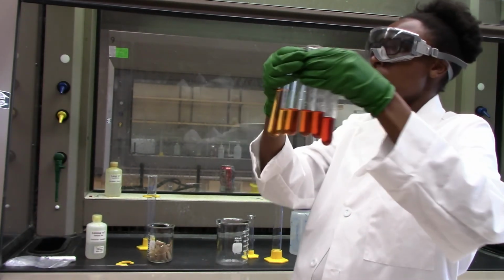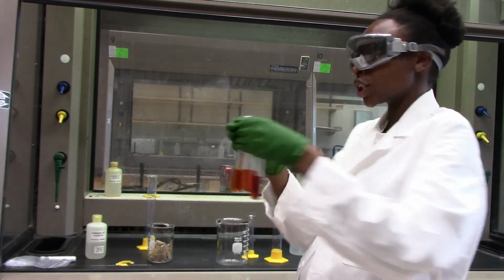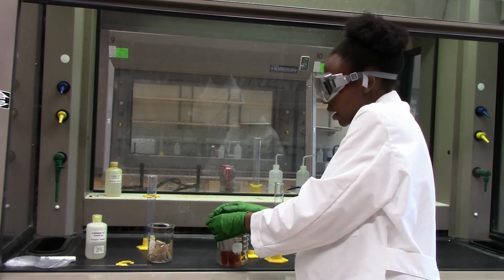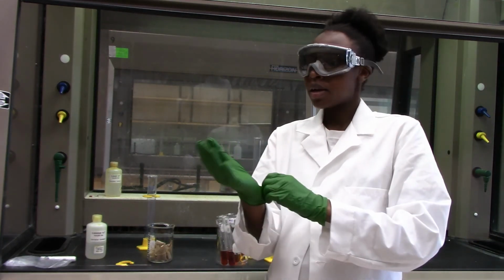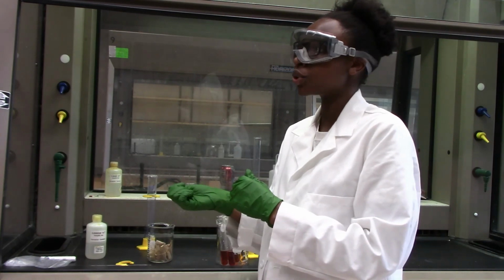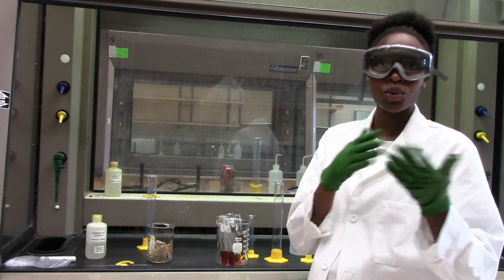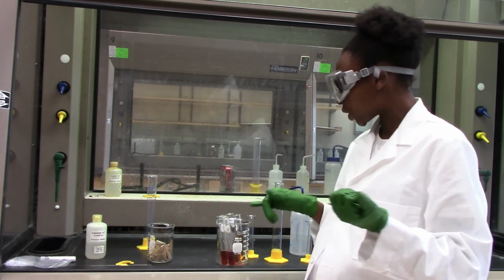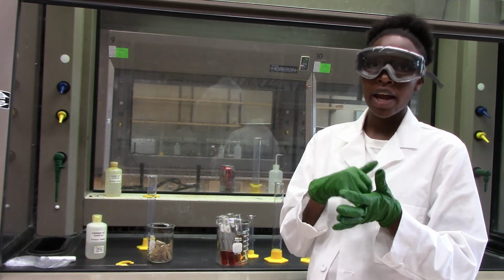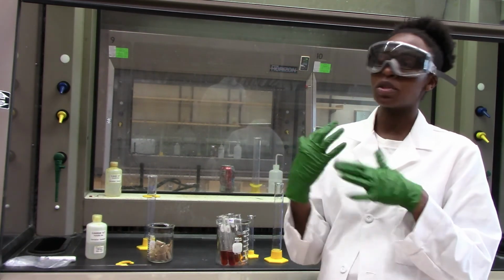Okay, so now having prepared all these different solutions, we are going to measure the absorbance readings. As I measure the absorbance readings, I will have the spectrum and then have the LoggerPro files given to you. Whenever you have your LoggerPro file, it will be labeled if it's solution 1, 2, 3, 4, and 5, and the standard solution as well. Then you will scroll to where you find the 460 nanometer wavelength, and that is where you will write down your absorbance value for the concentration of species at equilibrium.